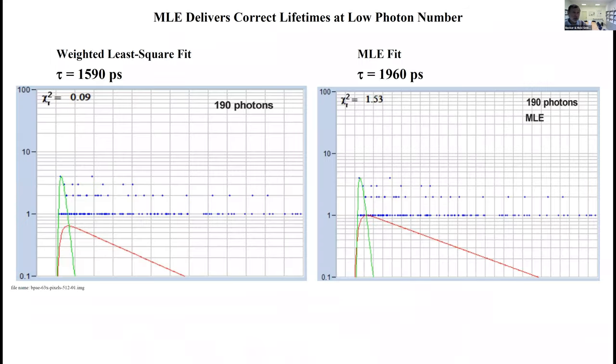Here's an example. Fluorescence decay with low photon number. This doesn't really look like a fluorescence decay, more like one photon or no photon. Least square fit delivers 1590 picoseconds. The correct value obtained by maximum likelihood estimation is 1960 picoseconds, so much better. We have solved the problem of low photon number.